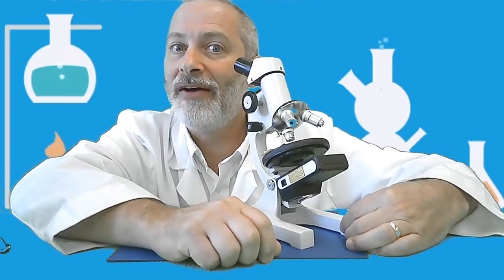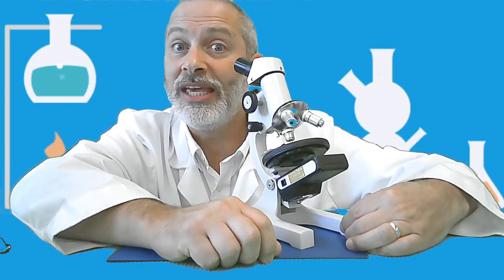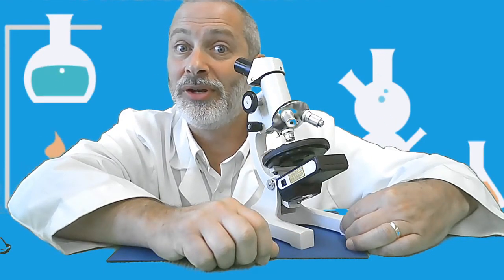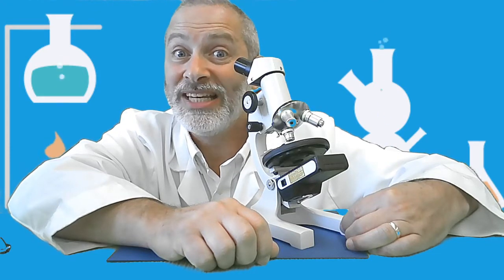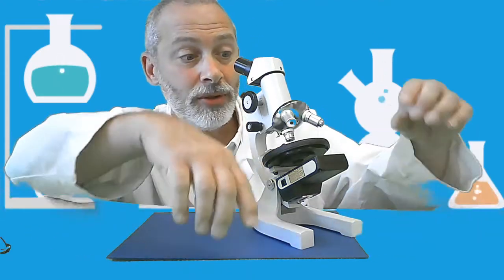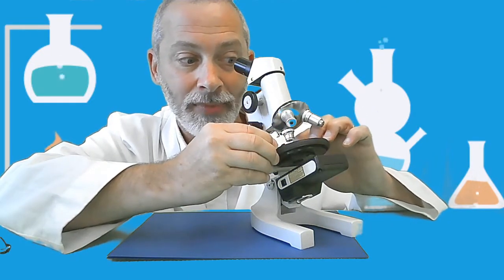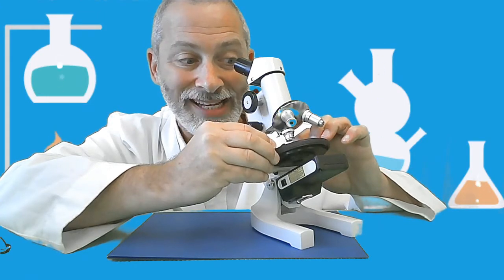How do I have to move the slide in order to move the image up? Say it out loud if you know. Hopefully you said the opposite direction, down, which is exactly what I'm going to do. What I want to look at is towards the bottom, and I want the image to go up, so I'm going to move the slide down.